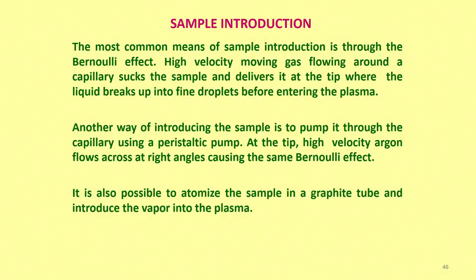with our program. The most common means of sample introduction is through the Bernoulli effect, that is, high velocity moving gas flowing around a capillary sucks the sample and delivers it at the tip. Here the liquid breaks down into fine droplets before entering the plasma. Another way of introducing the sample is to pump it through a capillary using a peristaltic pump. At the tip, the high velocity argon flows across at right angles, causing the same Bernoulli effect.